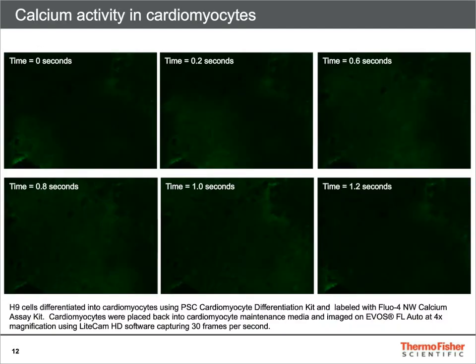Here we show calcium activity in cardiomyocytes generated using the PSC Cardiomyocyte Differentiation Kit over 1.2 seconds at 30 frames per second. Cells were labeled using the FLUO4NW calcium assay kit and imaged using EVOS FL-AUTO at 4X magnification.